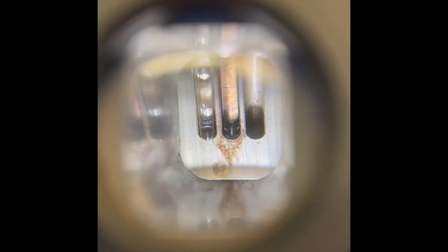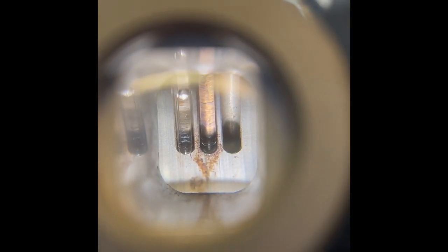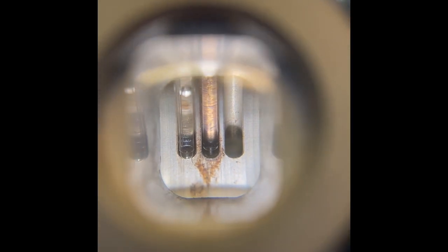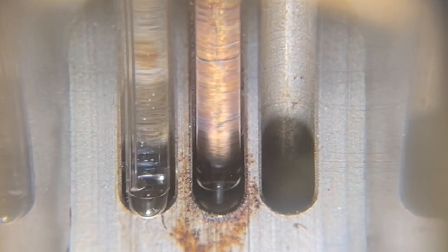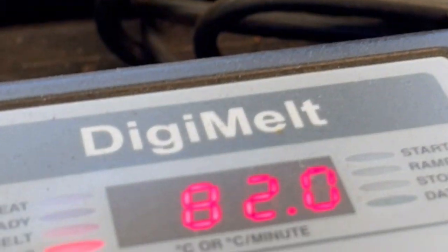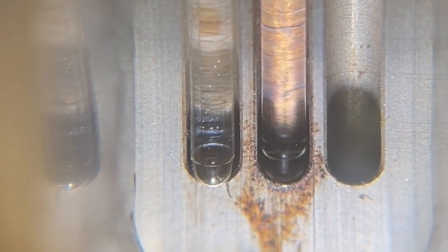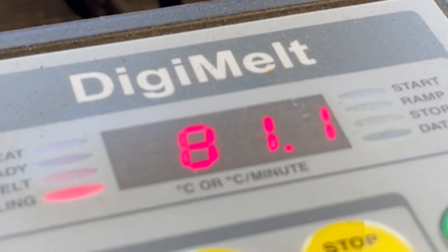Well, now that it's cooling, the bubbles are coming out because of the temperature or the vapor pressure. Sorry, I'm trying to think. Oh, it just went up. 82. You see that? It stopped bubbling because the liquid went up inside of the microbell because it's 82.